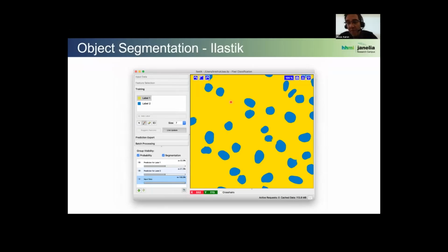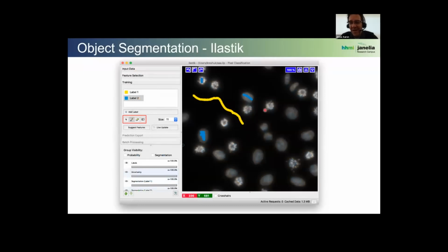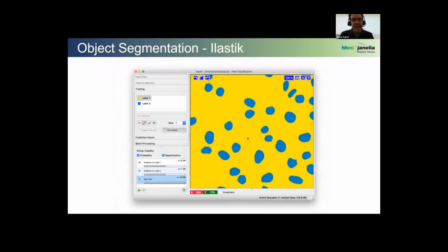And very easily it's going to be able to pick that out. A very powerful technique, and this is something that would be, frankly, a little tricky to implement using traditional techniques like thresholding, because again, for example, you have different morphologies of different kinds of cells at different stages, and so this is something that machine learning is really quite excellent at doing.